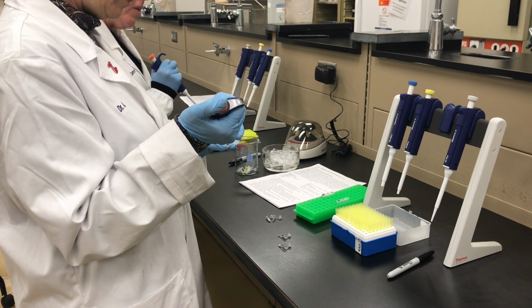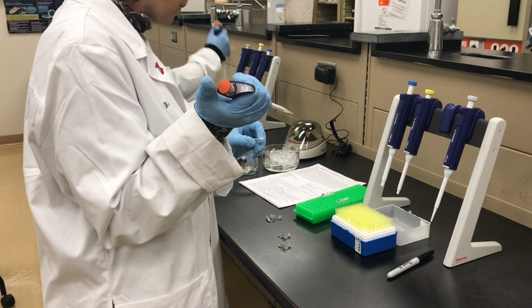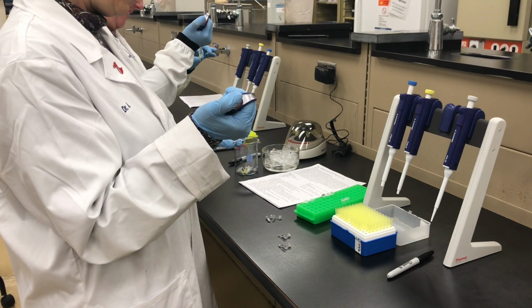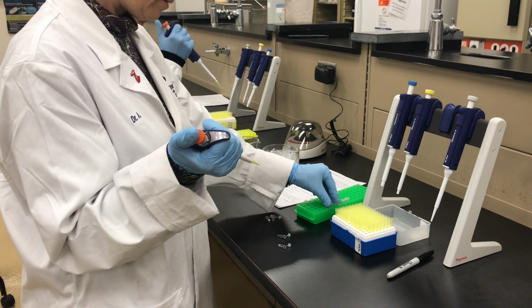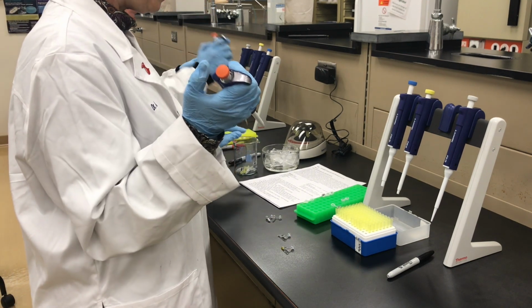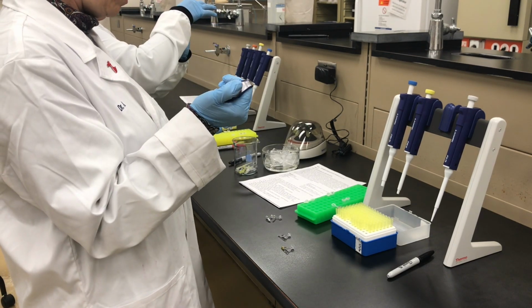You ran water first? Oh, shoot. Oh, yeah, we're all good. It's supposed to be primer. I just wanted to make sure I wasn't doing something. Oh, you're doing fine. All right. Primer, yellow. We'll do that. Okay. Primer to my second number 1 tube.